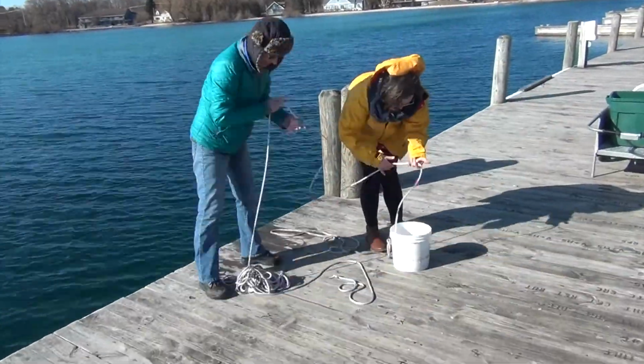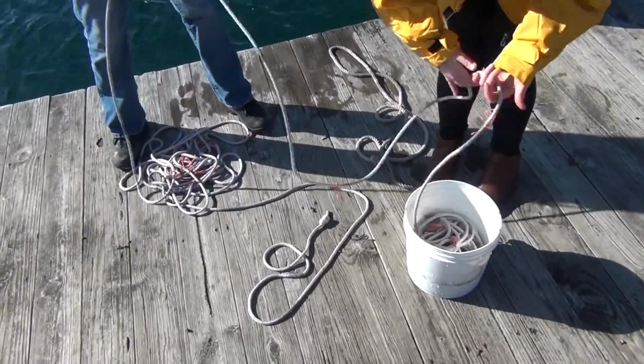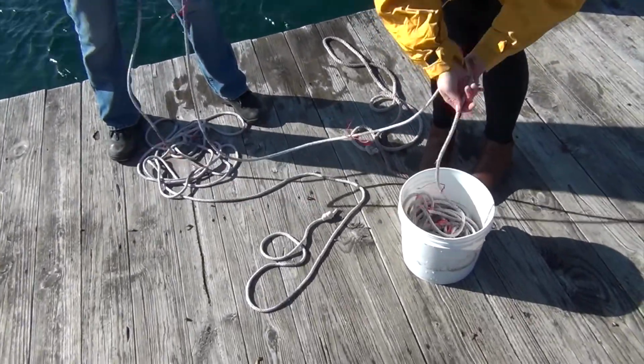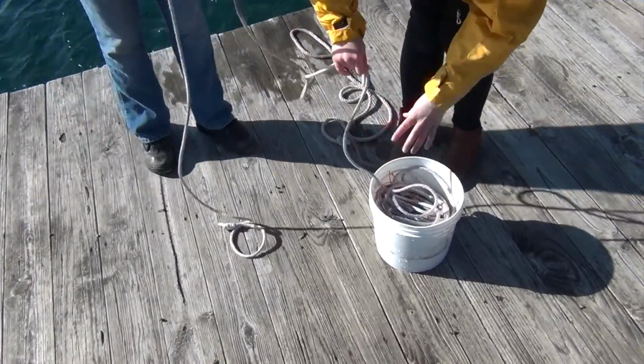As Rachel showed you earlier, to put the Secchi disc back, put the disc in the bucket first, and put the line on top. Again, there's no need to have perfect coils. As long as there's no knots and it's ready for the next instructor to use, you'll be just fine.